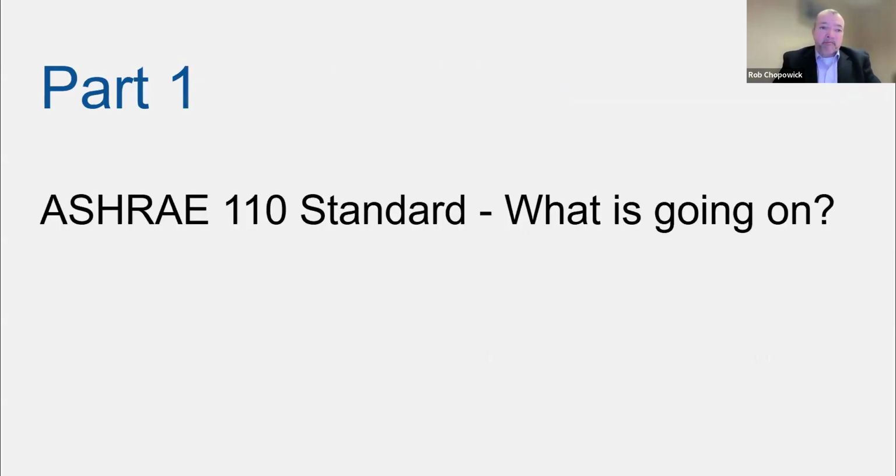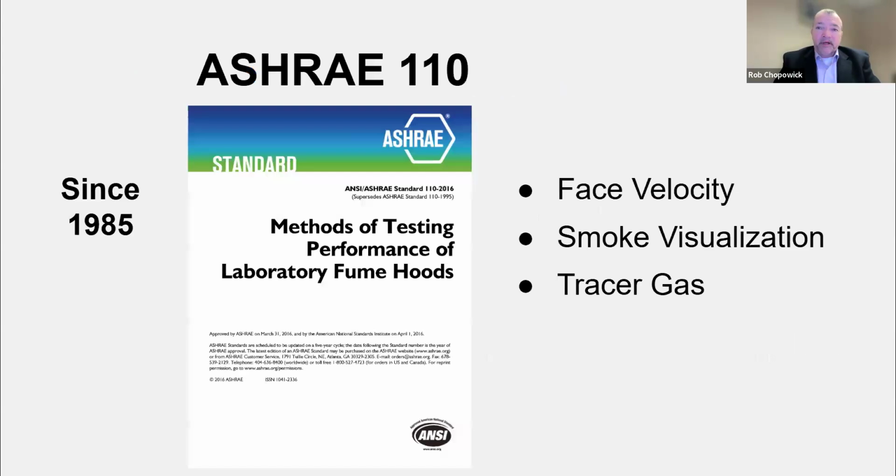So let's kick off with part one of this. We'll delve into the ASHRAE 110 standard. Now, this standard's been around since 1985, and it consists of three basic tests.